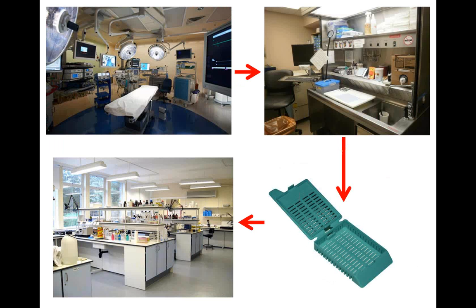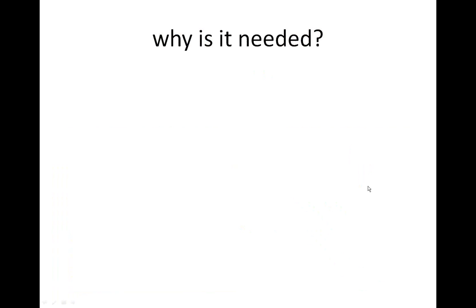Now, in that case, it simply won't do to wait one or two full days, because by that point, of course, the patient's out of the OR and there's nothing else that can be done. So what we'll do in cases like that, when the neurosurgeon requests it, is take the tissue, instead of putting it right into tissue cassettes for the histology lab, we'll stop right here and do a rapid intraoperative consultation.